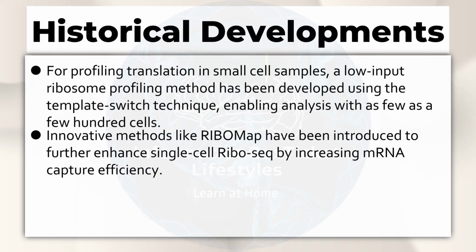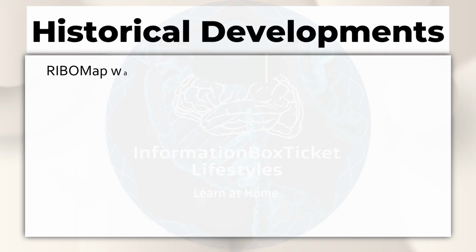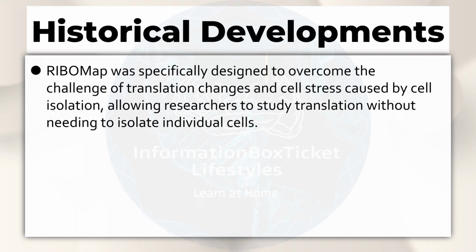Innovative methods like RiboMap have been introduced to further enhance single-cell ribosome sequencing by increasing mRNA capture efficiency. RiboMap was specifically designed to overcome the challenge of translation changes and cell stress caused by cell isolation, allowing researchers to study translation without needing to isolate individual cells.